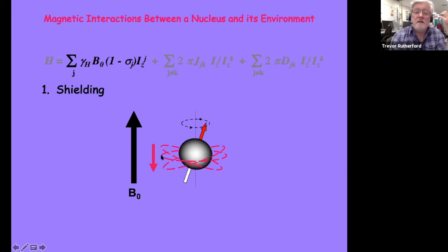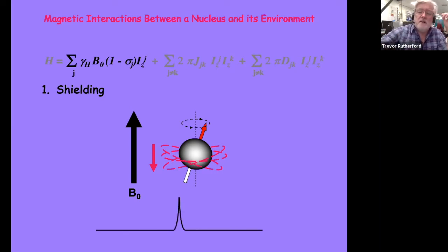Now, anywhere that you get a movement of charged particles, you will have associated with that a magnetic field. And it is this collection of magnetic fields in the molecule that gives NMR spectroscopy its tremendous usefulness. So what we will get for each nucleus in the molecule is a characteristic frequency in the spectrum. And we'll characterize that by a frequency that's referred to as the chemical shift.